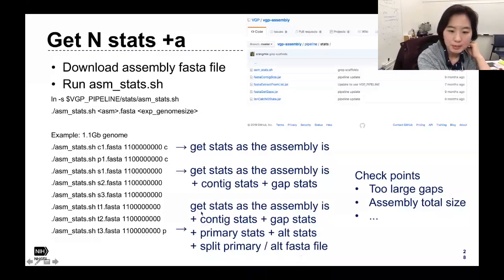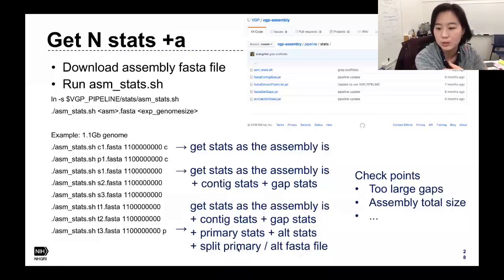I will probably come back to this in the next training session. Once we have the Long Ranger FreeBayes polishing app available, I will go over it. I think it's a good time to go over both of them and show you how to submit genomes to Kirsten's group.